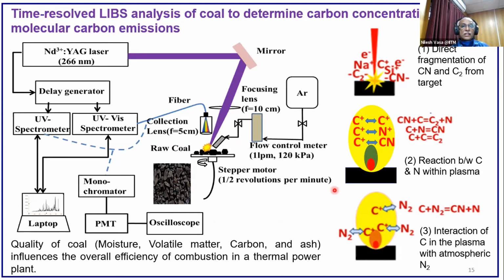What we focused on in this study is whether we can do time resolved LIBS analysis of coal to determine carbon concentration using molecular carbon emission.